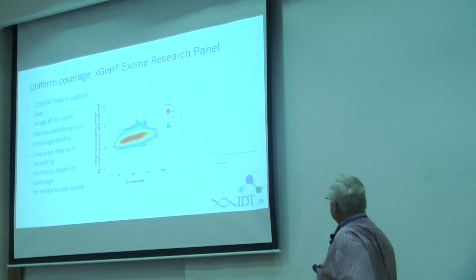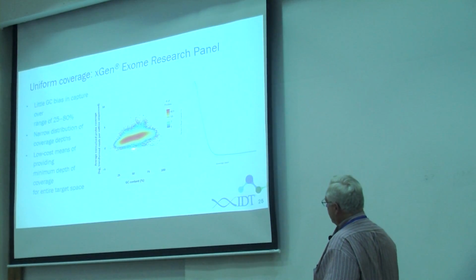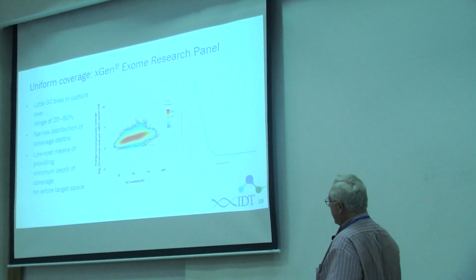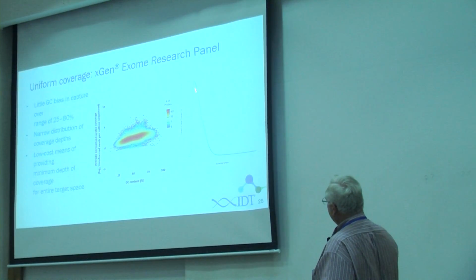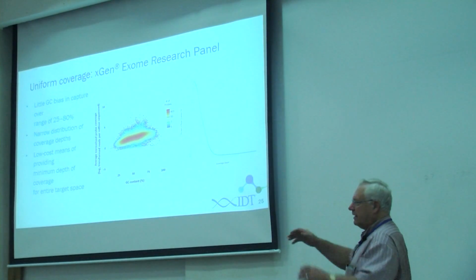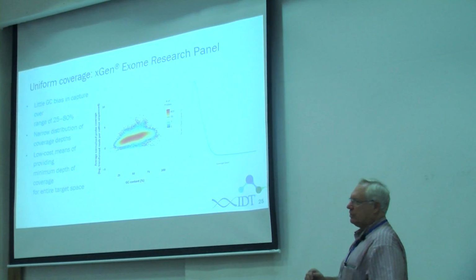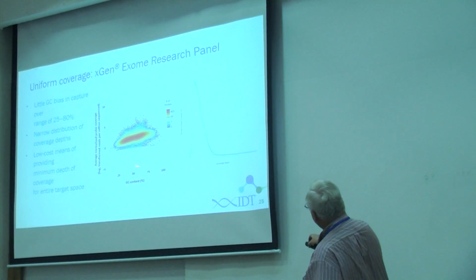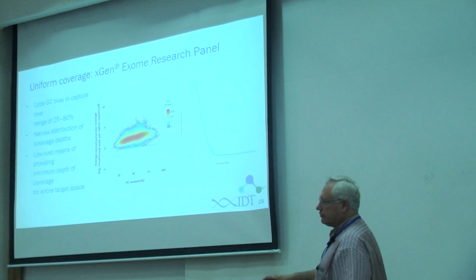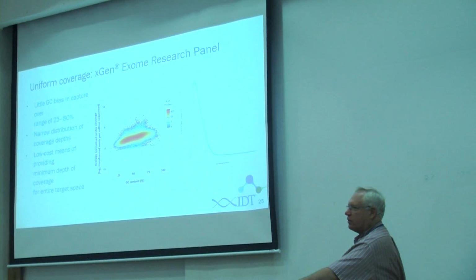And this sort of shows that point of the uniformity of coverage. This is the uniformity of coverage that we're seeing on the exome capture set. And you can see across the whole GC range that it's incredibly flat. And the actual sequencing coverage depth is a nice sharp spike. What you don't want to see for that is a real fat spike, meaning that you've got such widely varying capture efficiencies. And what we see is a nice sharp spike, which means that the capture efficiencies are good enough that for any domain area, you can begin to start calling copy numbers.